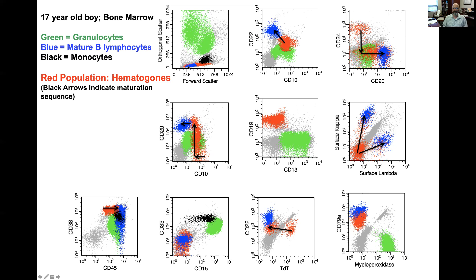In terms of the forward and side scatter, they don't have much granularity. This red population varies from small cells up to about medium-sized cells, maybe a few large ones sometimes — so they are variable in size. Eventually they go down to the size of a mature B lymphocyte. And if you look at CD19 versus forward scatter, once you get used to looking at these, you'll almost always know that there are hematogones in the specimen.